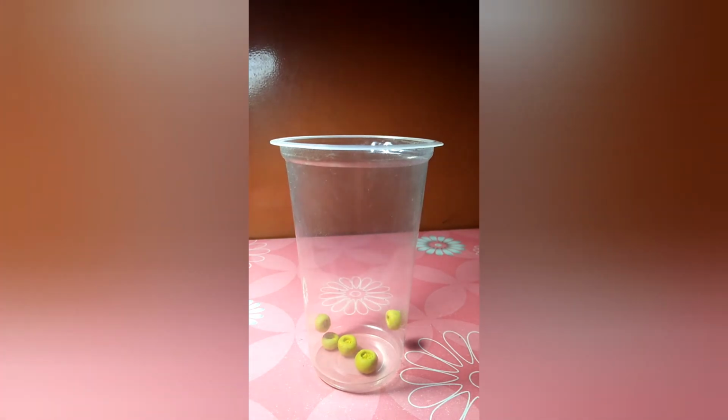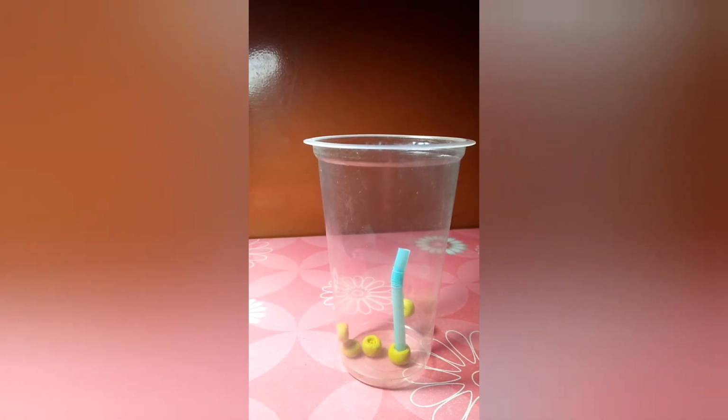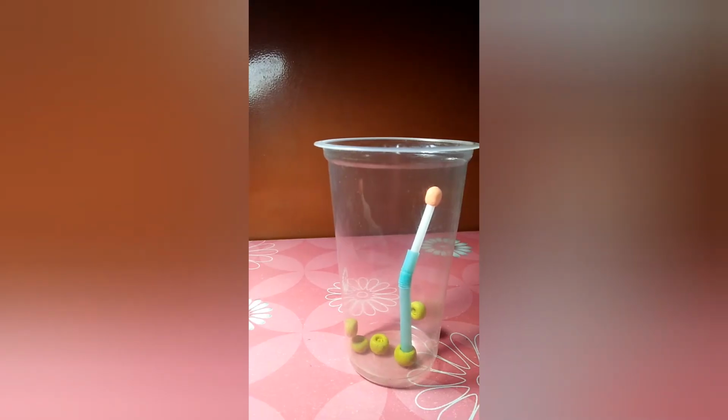Now let's see another type of ELISA, that is indirect ELISA. This is similar to the direct ELISA as the antigen is immobilized to the surface of the well. Now when we add the serum, the primary antibody binds to the antigen which is specific for it. After that, we add the secondary antibody which binds to the Fc region of the primary antibody.